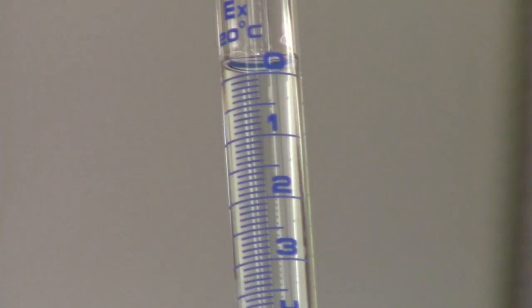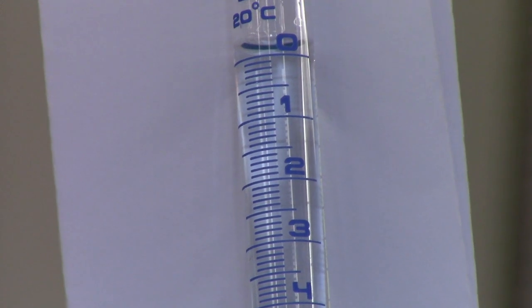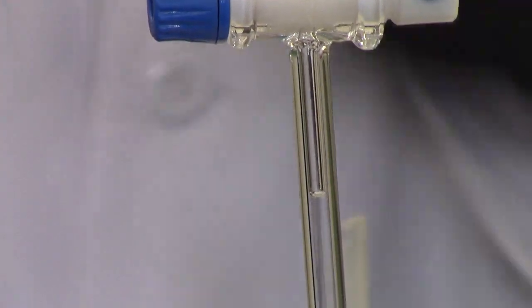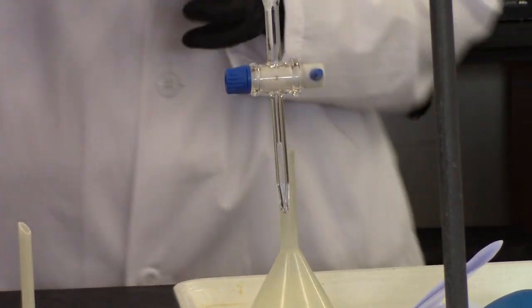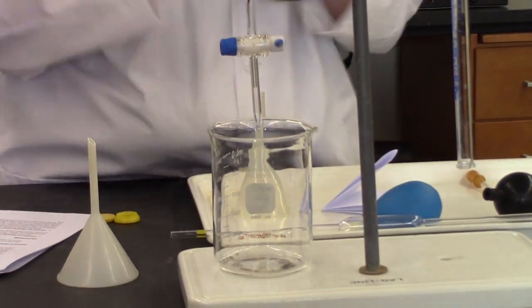I think the white might be the best way to view this. So it's a little bit above zero at this point, but that's okay because we can just drain it out. And I'm not ready to titrate yet anyway, because if we look down here, we can see that there is a gigantic air bubble stuck in here. So what we do is we're going to use a larger beaker for a waste. This way, if anything drips or if I overfill or anything goes wrong, then there's something to catch the mess. All right, so this is going to be my waste beaker.